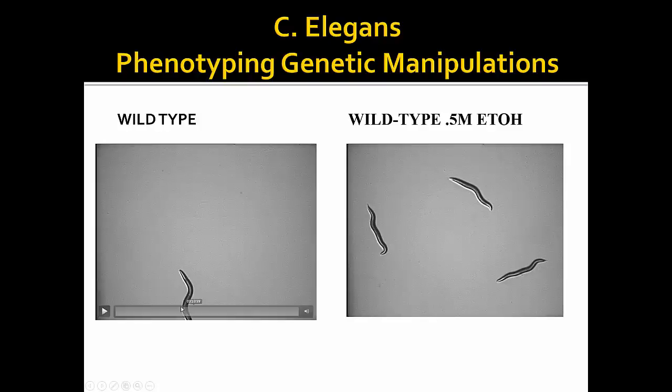And you can see here with these wild type worms, see how they make these deep bends. I'm sorry, the mouse is getting to me. You see how they make these nice deep bends as they move. So you can alter that genetically to take out that physical movement.